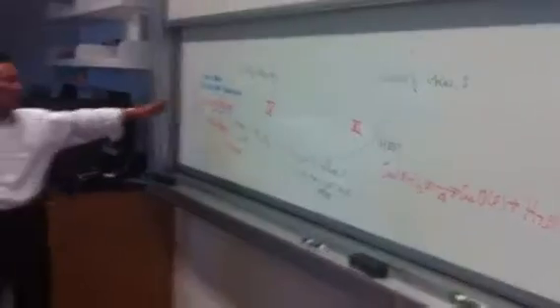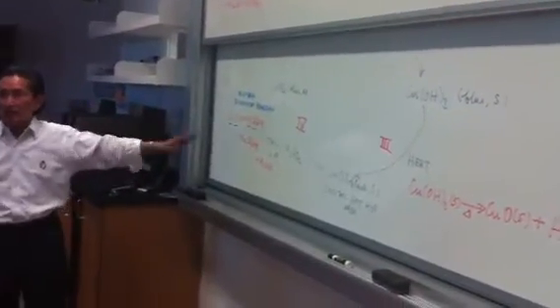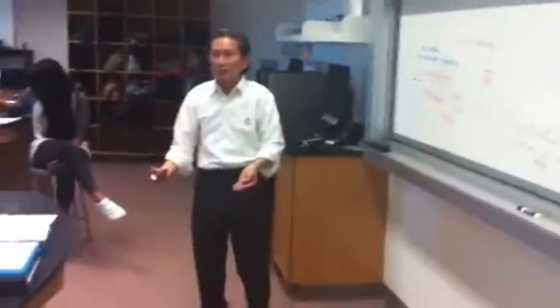It's vague in terms of acid-base reaction, but the solution is dissolving.